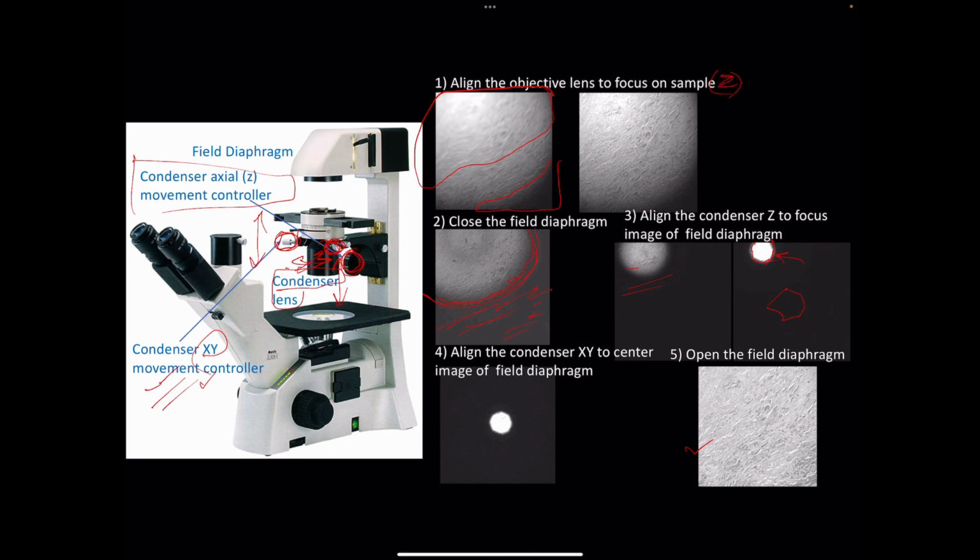You heard me right. This is not something you do once a month or you can get rid of it. This is something you have to do. You also cannot call your microscope specialist or a microscope manufacturer to get this done for you to get an optimal image quality, because it changes in your lab. Someone might want to do the imaging at 20x and you might want to do another time at 40x. You cannot call up your microscope manufacturer and ask him to do it for you so that you can get a better image. You have to learn and master this skill to get your Kohler illumination done every time before you start the imaging, and every time you change the magnification of your objective and change the objective while you are imaging.